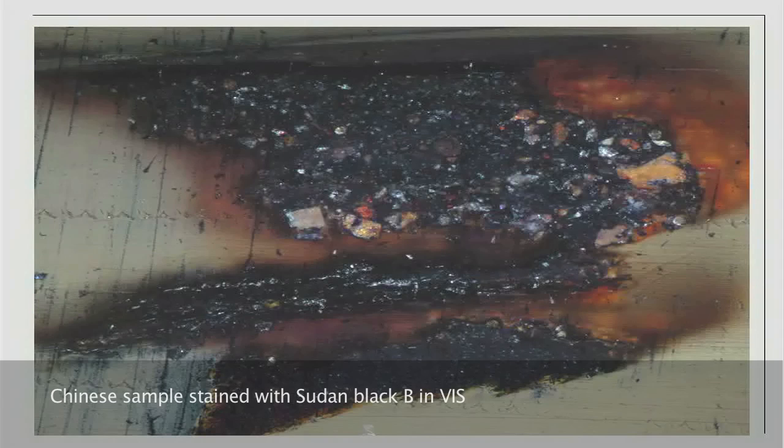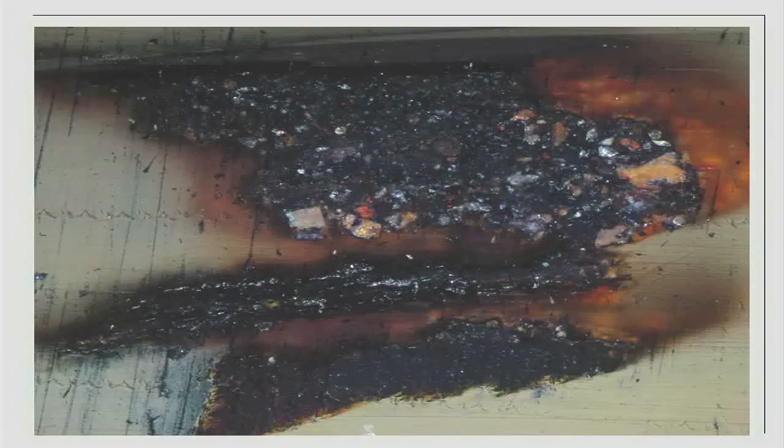The Chinese lacquer sample gave similar results, whilst here, in addition to the foundation layers, the fibrous layer and the wood substrate also took up the stain in some areas. Hence, it can be assumed that all these layers contain some oil or lipids.